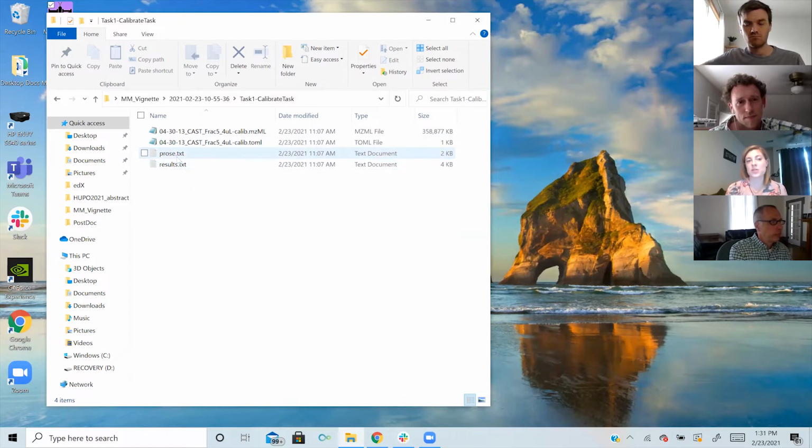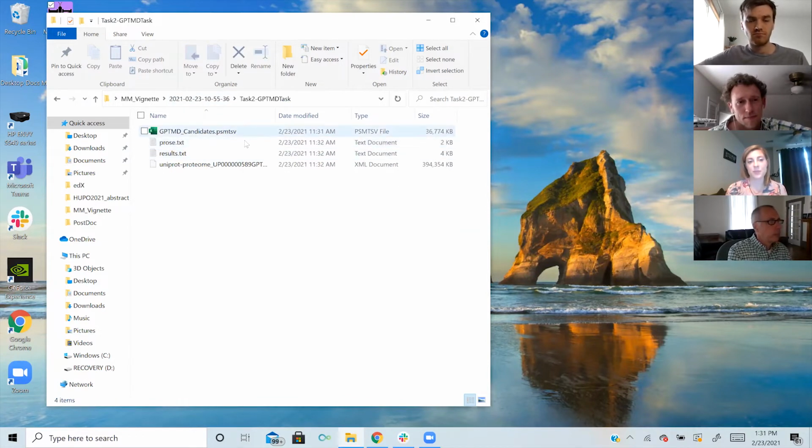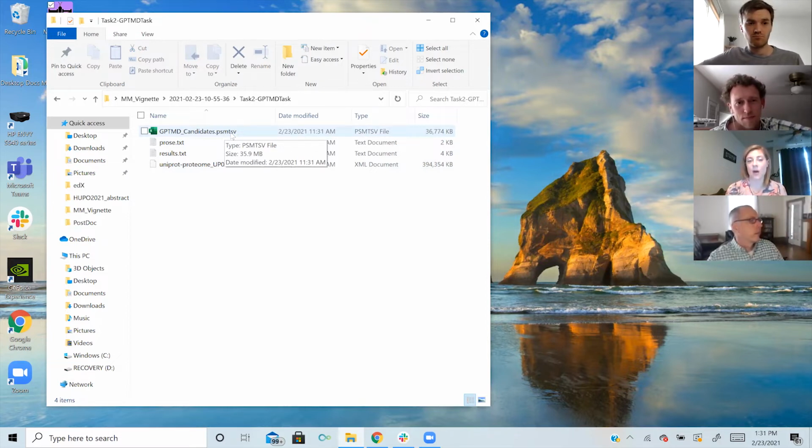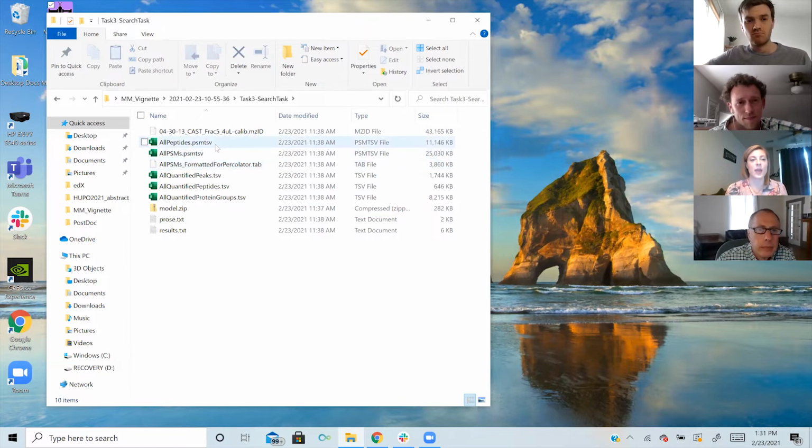The results file just gives some additional information on those files here. GPTMD has our new database that we would use for our subsequent search, and it also gives you a TSV file with all of the various PTM candidates, what was summarized in that all results file that Dr. Shorey shared. And where the rubber really hits the road is here in our search tasks, where we have our all peptides, PSMs, peaks, and protein groups.